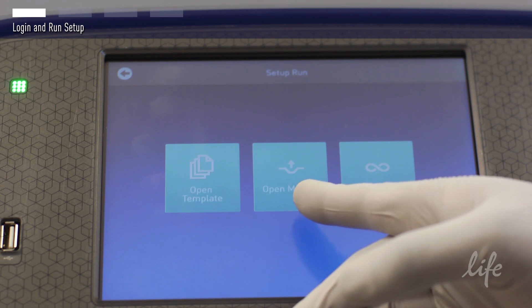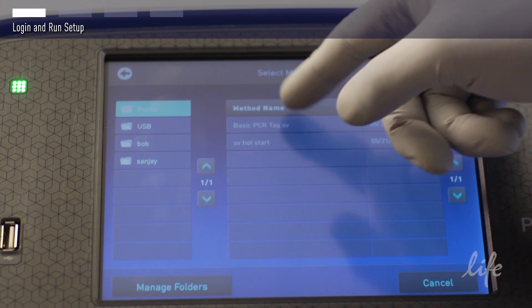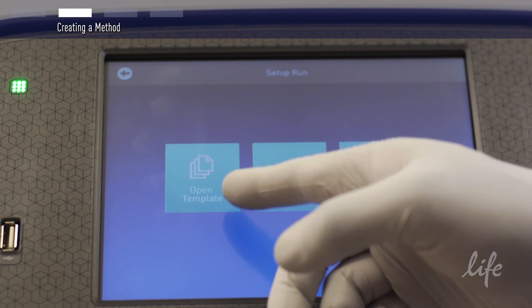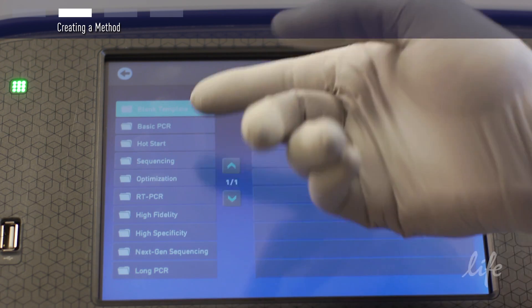You can select using the open method option to access your own personal folder or look at methods from another user. If you have not created any method files yet, you can select new method to design your own protocol or choose from a list of preloaded methods.